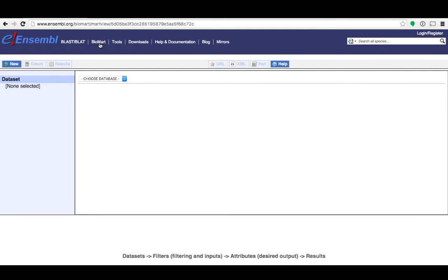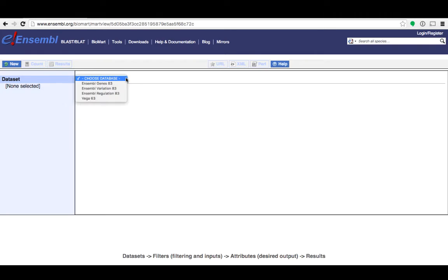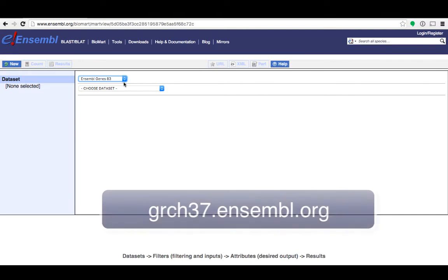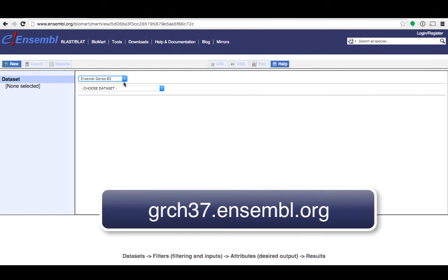So in this first example I'm going to show you how to access Ensembl gene IDs from a list of HGNC symbols. The first step is to choose the database. Today we'll be looking at genes so I'll select Ensembl genes. Biomart will always show you data from the latest release which at the time I'm making this video is release 83. If you want to use human GRCh37 assembly you can access that through the dedicated site.